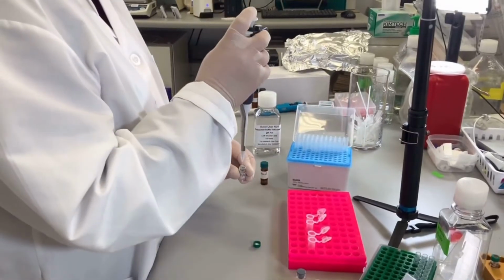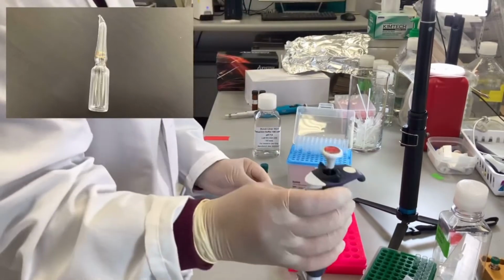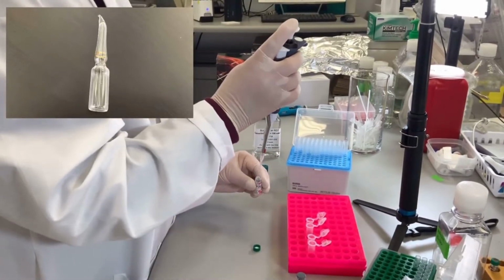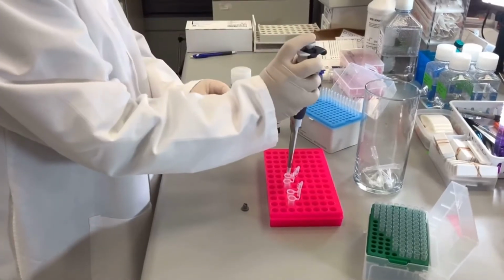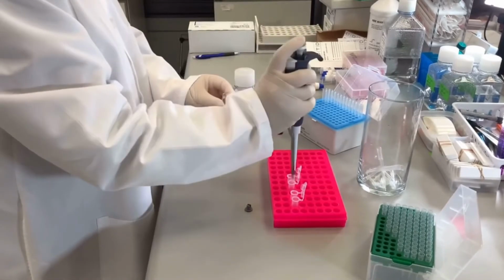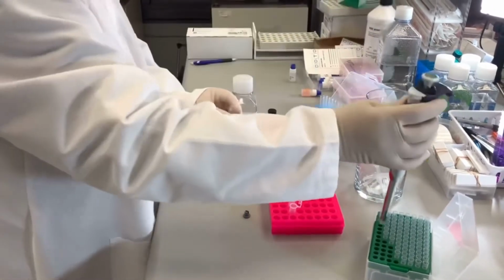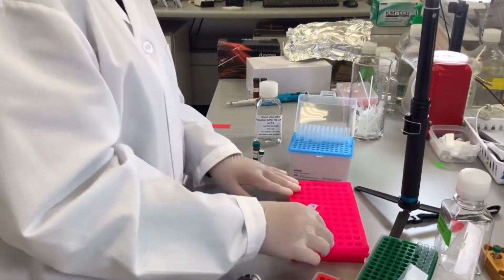Add 1 to 2 microliters of mycolactone and mix well. This comes in a glass ampule and is very precious. Do not waste it. Add 40 microliters of magnetic nanoparticles to each vial with positive and negative controls, using a new pipette tip each time in order to not contaminate the magnetic nanoparticles.